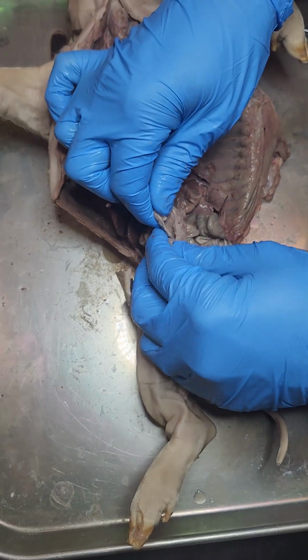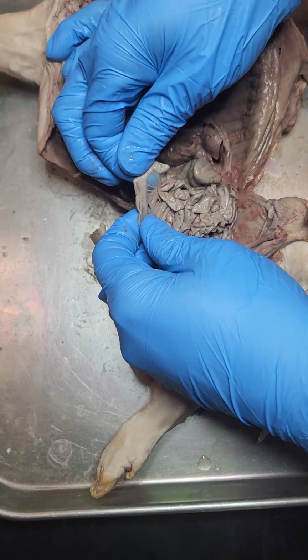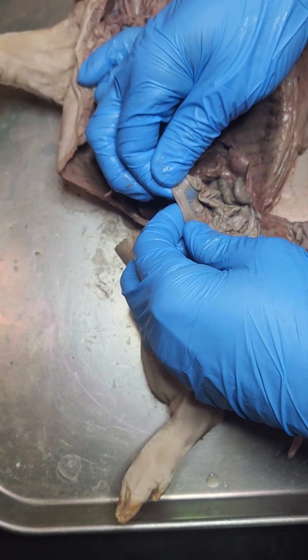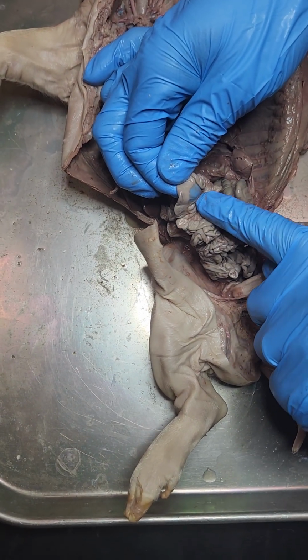Mesentery is the material that when we pull them apart, they have this webbing in them. And that's capillaries, that's arteries and veins, and that's how we get absorption of our food into our bloodstream. So as it's traveling through these small intestines, we're having diffusion occur, and these molecules are diffusing into the bloodstream.